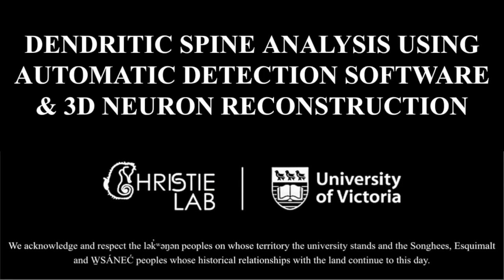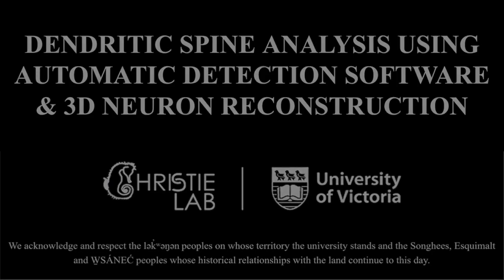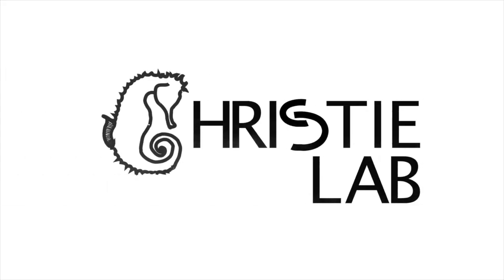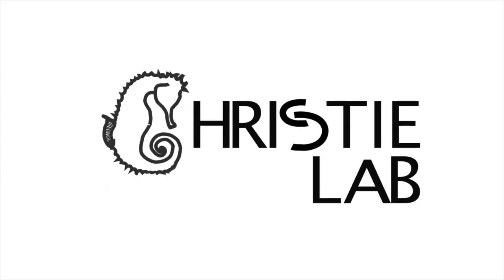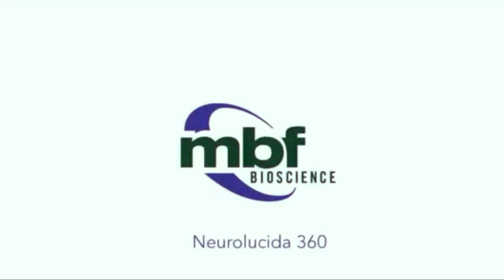In this video we'll go over how to analyze images of dendritic spines using automatic detection software and three-dimensional neuron reconstruction. This software is courtesy of an MBF bioscience program called NeuroLucida360.